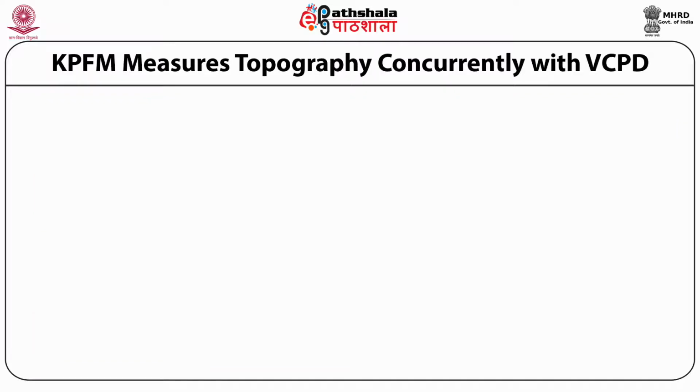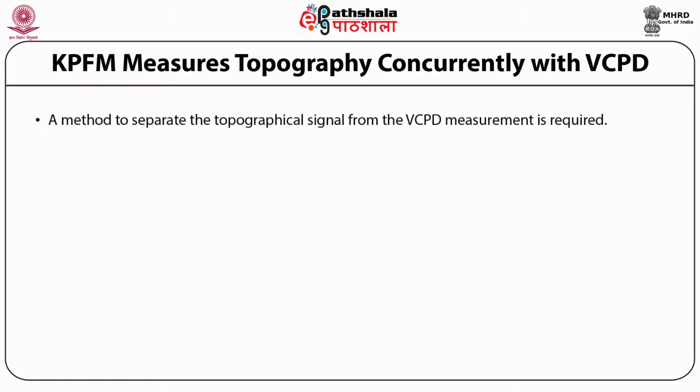In what way can KPFM measure topography concurrently with the potential CPD? In this slide, we will be talking about the way we measure topography with KPFM, how KPFM will measure topography and this potential together using an AFM tip. A method to separate the topographical signal from the VCPD measurement is required.